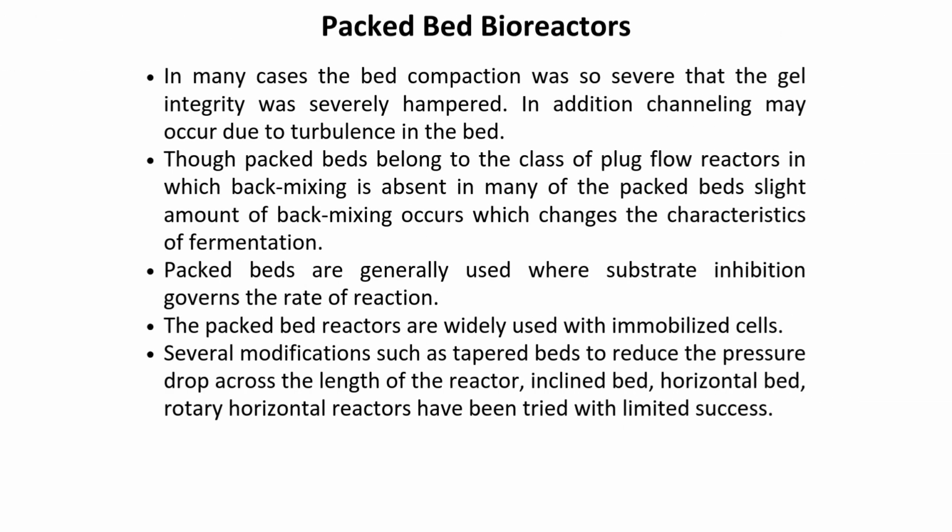In many cases, bed compaction can be so severe that the integrity of the gel particles is damaged. Additionally, channeling may occur due to turbulence within the bed. Although packed beds are considered a type of plug flow reactor where backmixing is absent, a slight amount of backmixing often happens in practice, which can change the fermentation characteristics.